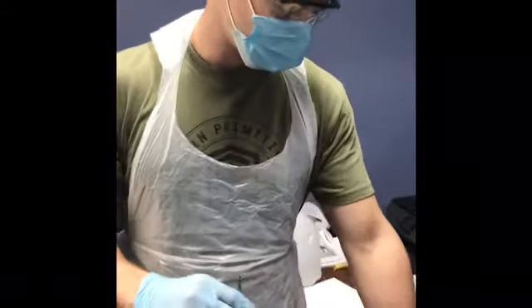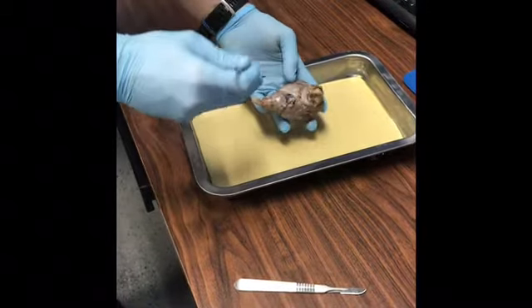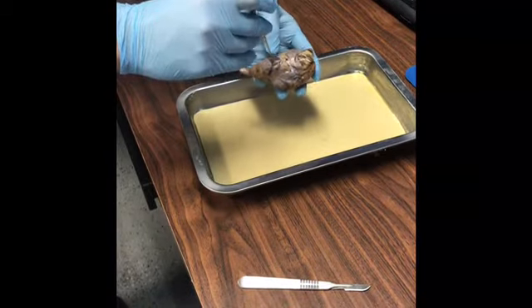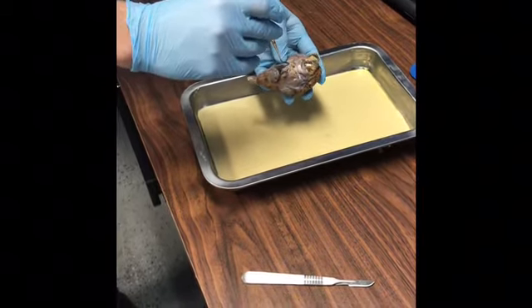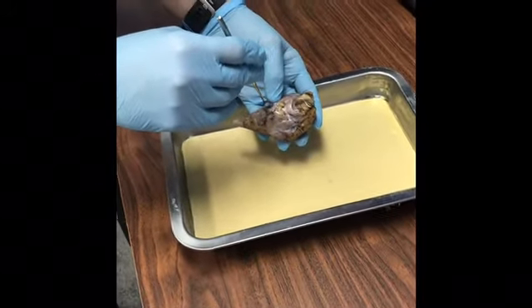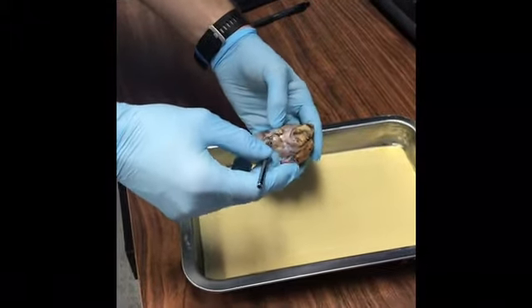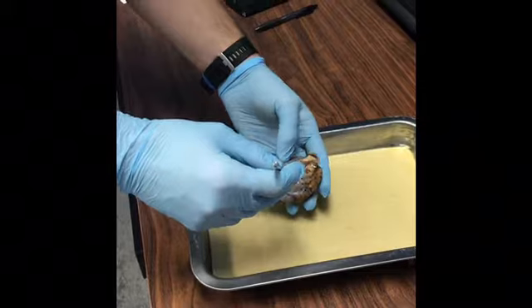Hey, my name is Derek Murdoch, and the first thing I'm going to explain is the meninges. The outer layer of the meninges is this dura mater. That's the white milky part, and then the one that's right below that is the arachnoid, and then the one below that is the pia mater.